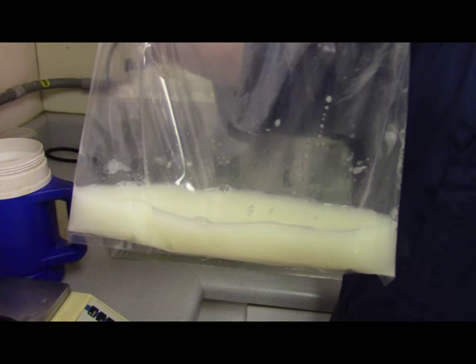A quick assessment of the odor and appearance of the semen should be performed after each collection. The semen should not have a foul-smelling odor and must be free of blood, pus, and dirt or other contaminants. Blood or pus in the semen tells us that the boar has a urogenital infection, and the presence of dirt or other contaminants means that we need to improve our collection techniques. Contaminated semen should be thrown out, as it may introduce or spread an infection in the sow herd.